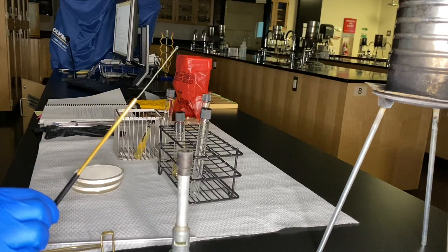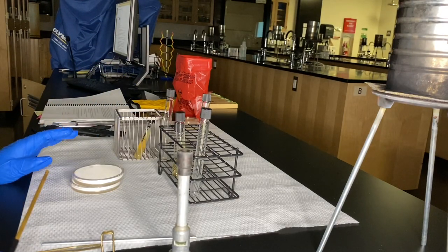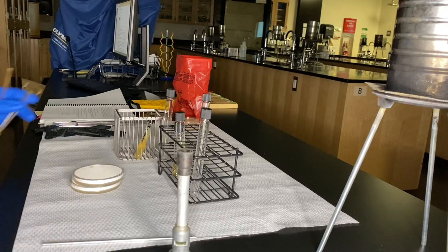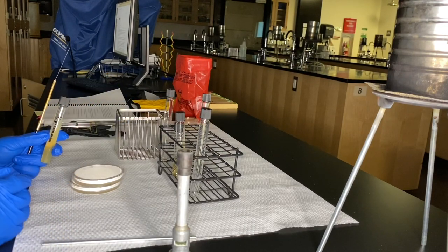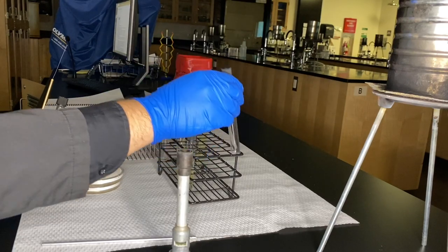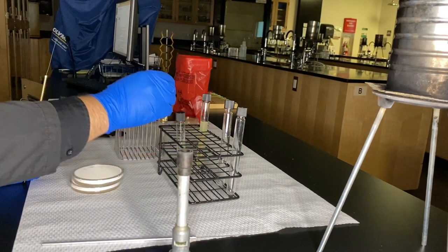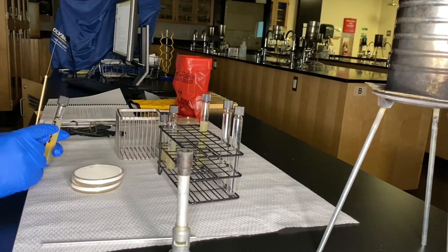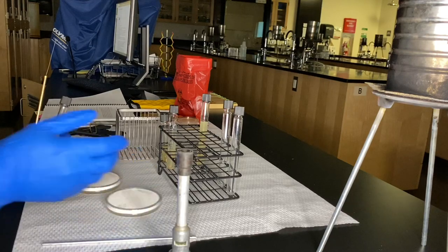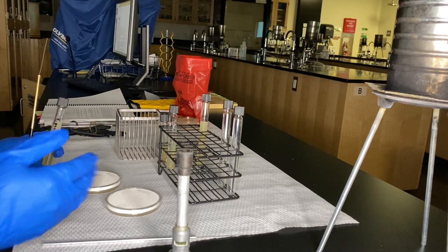We'll use our Bunsen burner to sterilize the loop and wait 15 seconds as discussed, then transfer from point A to point B. Have your sample ready and your destination ready — we'll start with the broth first. Once that's done, go from point A to the slant as the new point B, and then one more time to the plate. It can go relatively quickly if you plan ahead and have your setup ready to go.